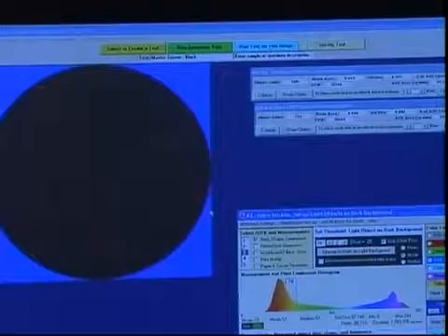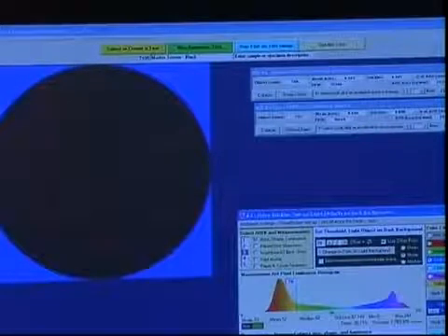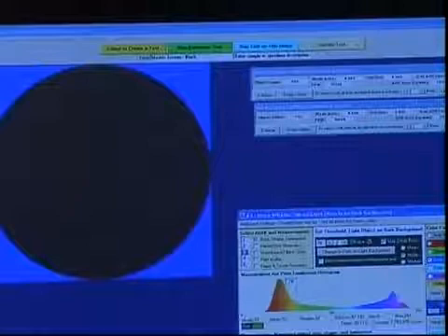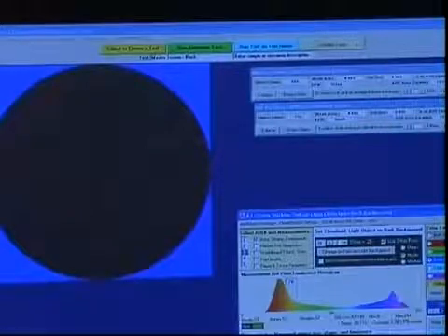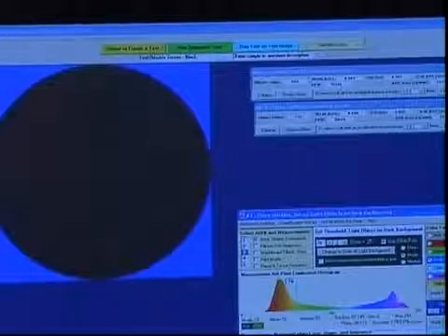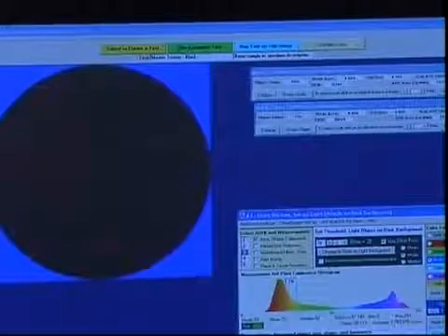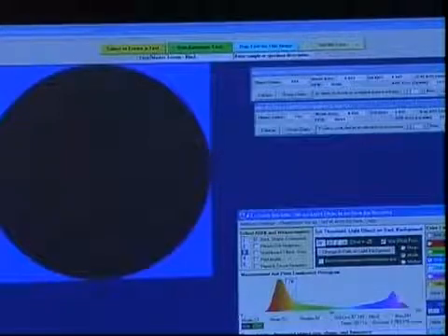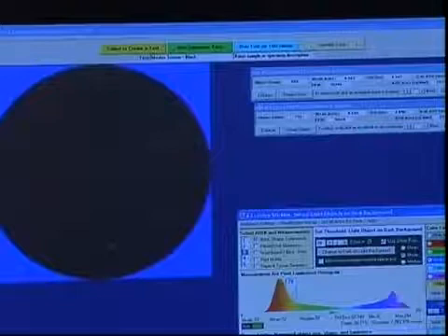hairy stickies. These, 0.08 is a minimum again. And we're looking at anything that is not round because these are the jagged fiber. But the luminous value is brighter than just the fiber by itself. So it's 110 to 255. We'll do the measurement again.